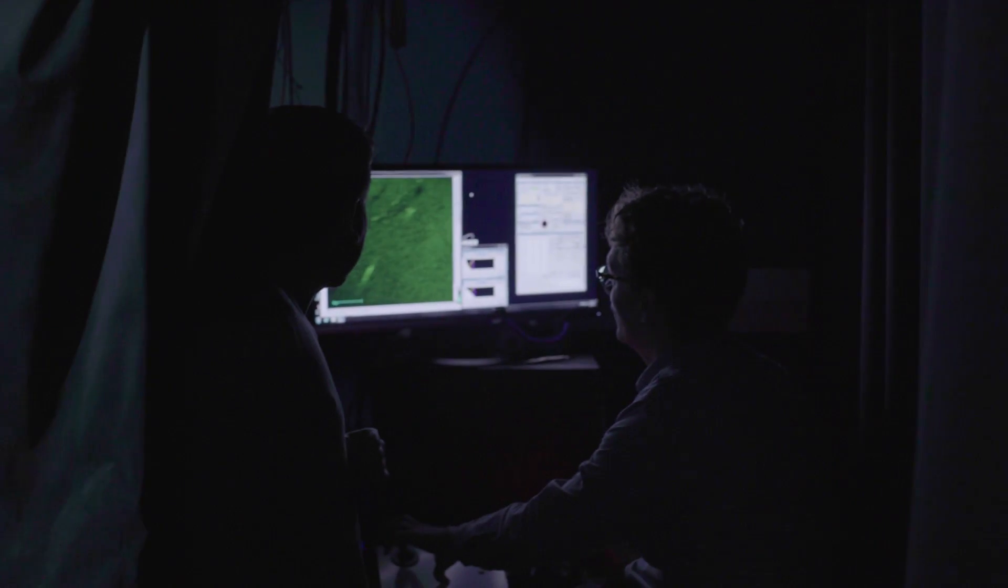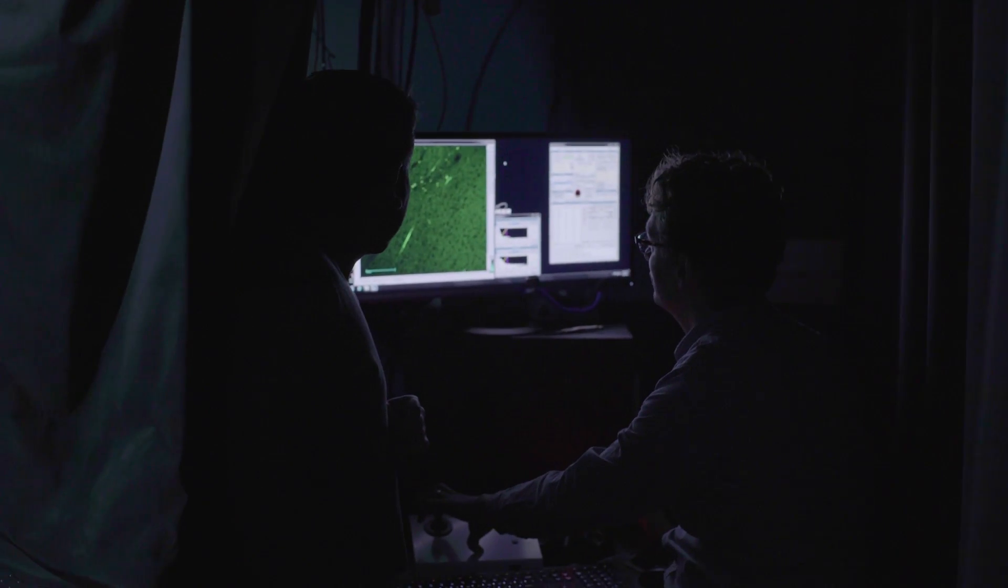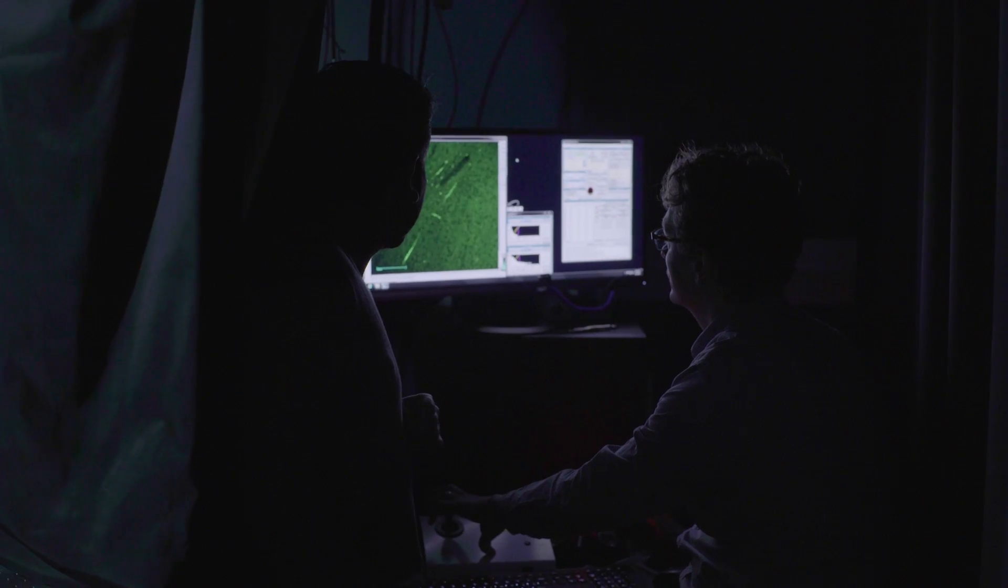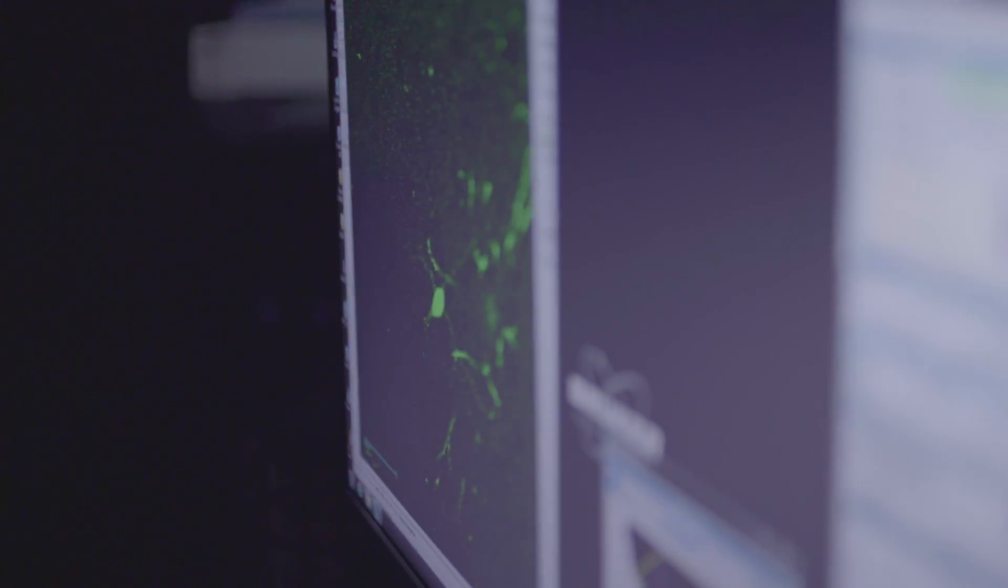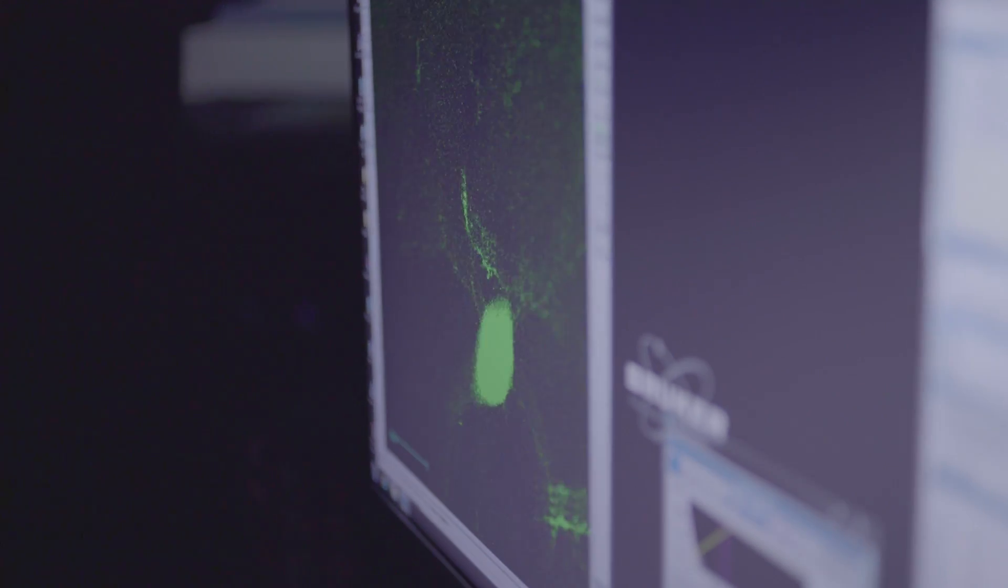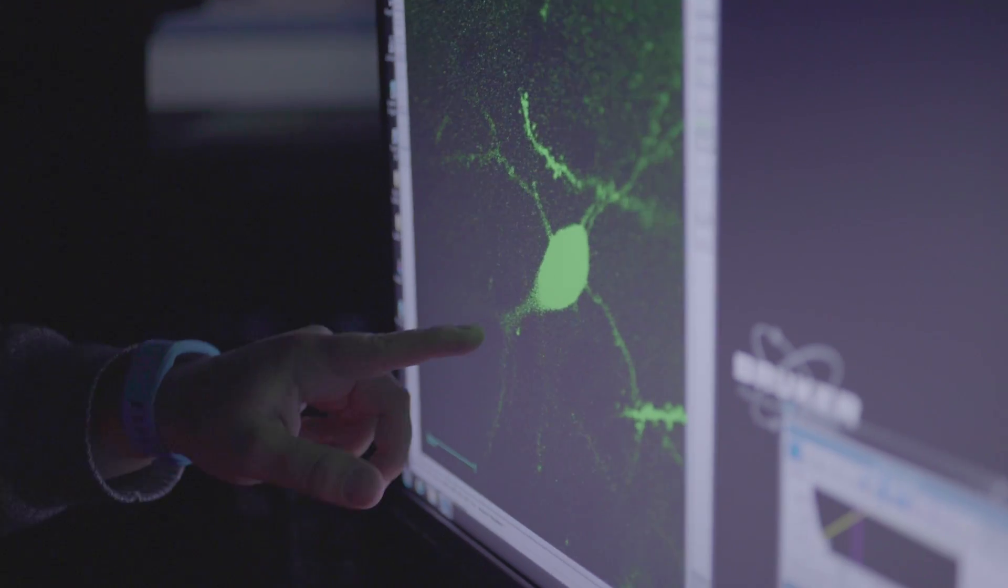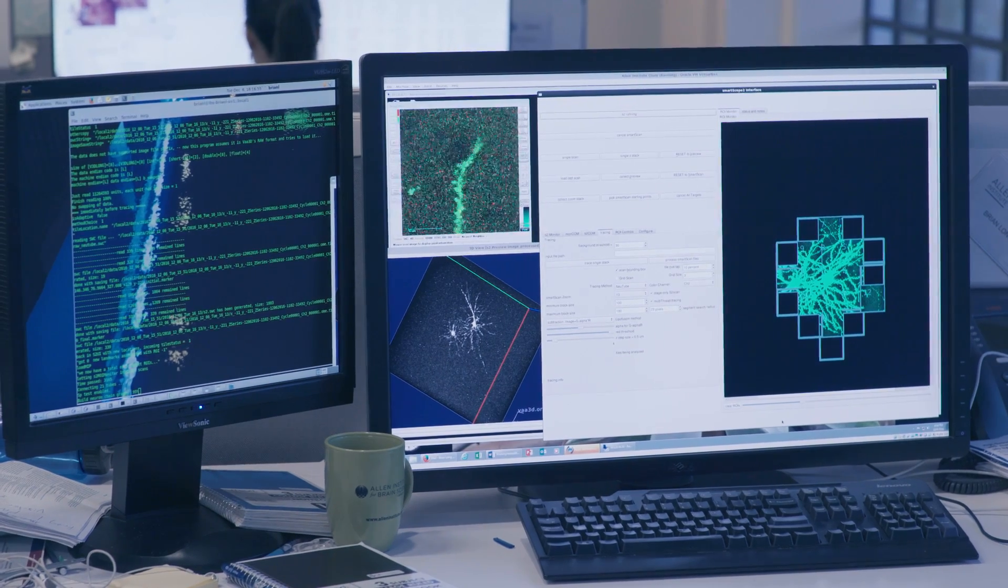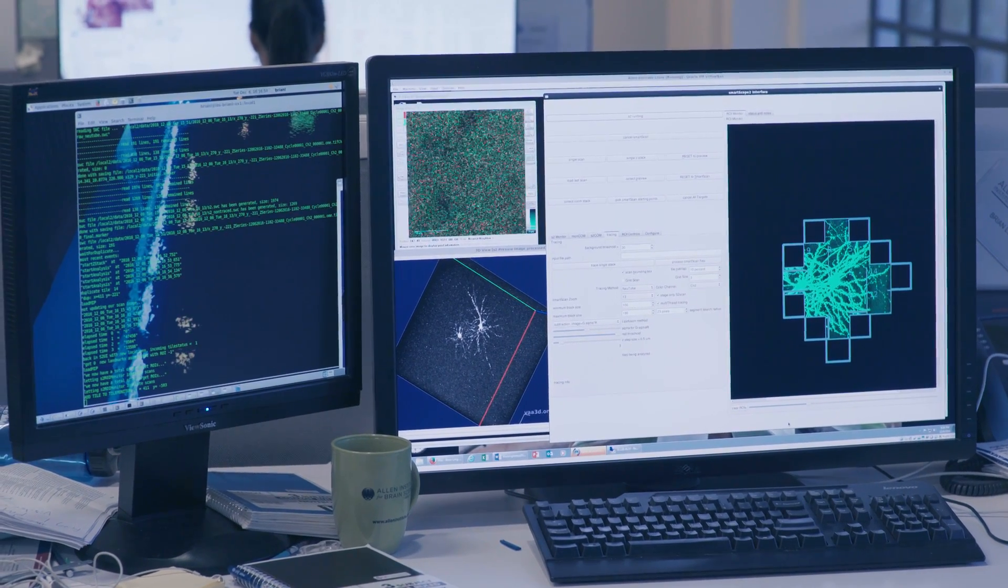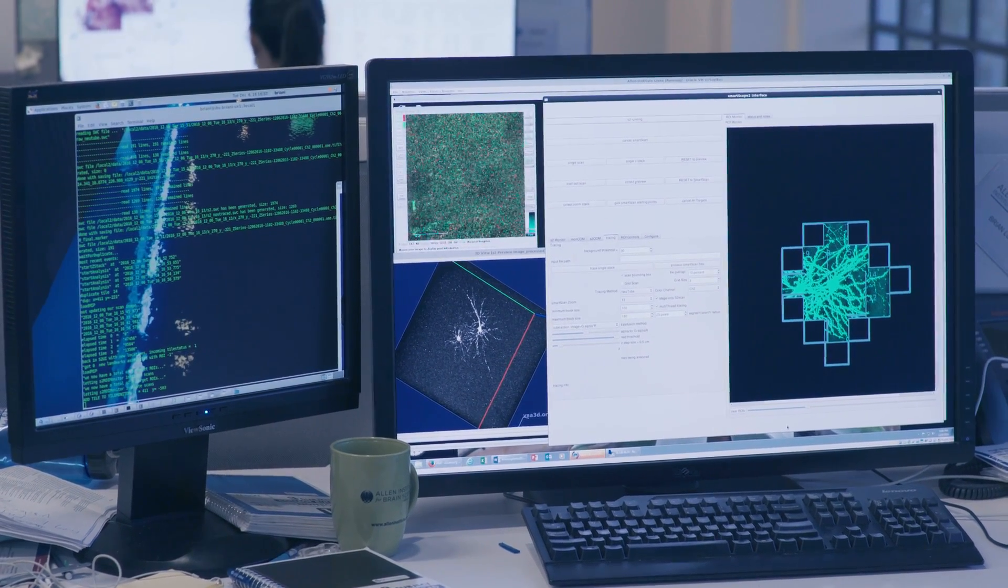The project I'm working on is called smart scope, and smart scope is an automated two-photon microscope that uses online image analysis to generate neuron reconstructions. Smart scope solves two problems: one problem is that imaging the entire sample takes a lot of time, and smart scope solves that by reducing the imaging volume to contain only the signal that we're interested in.